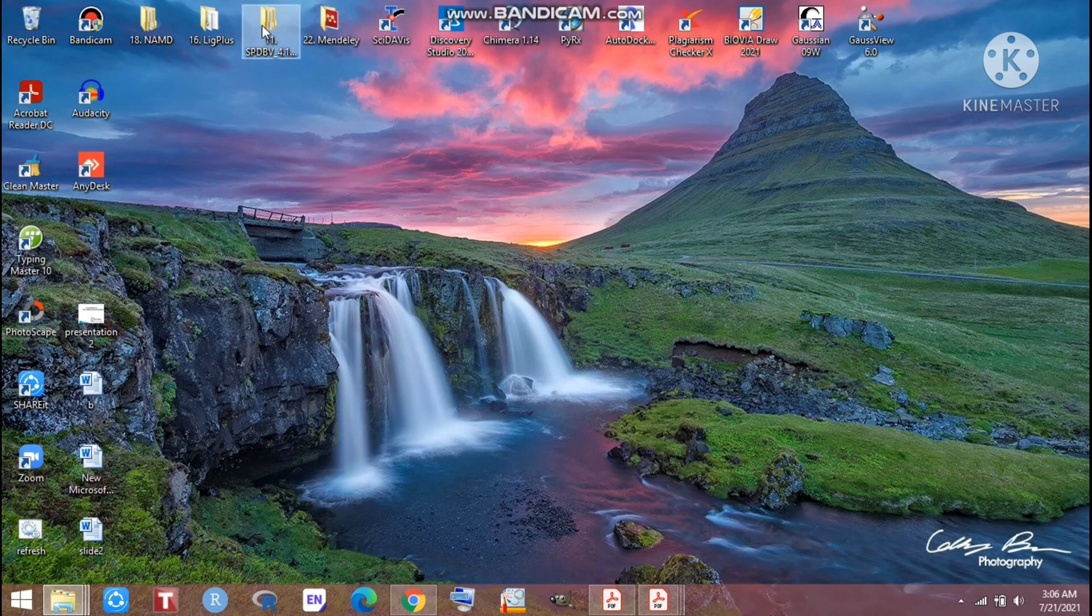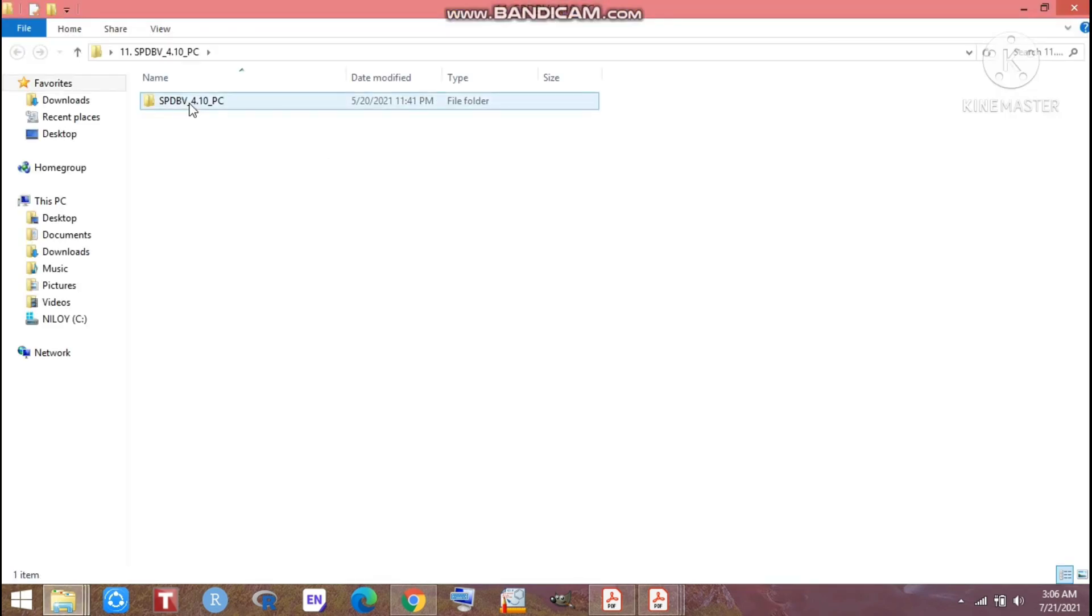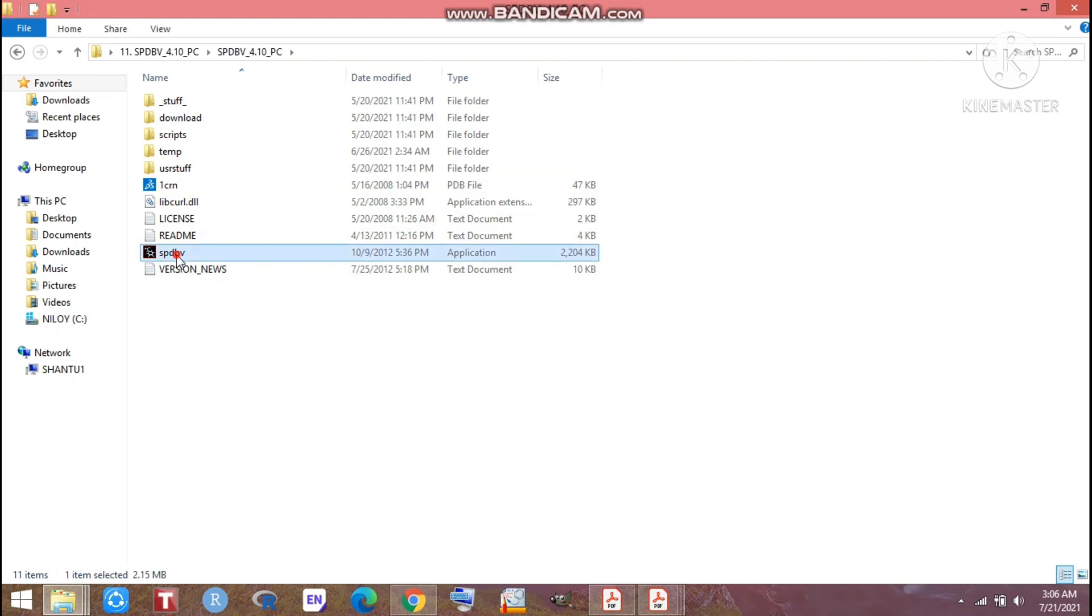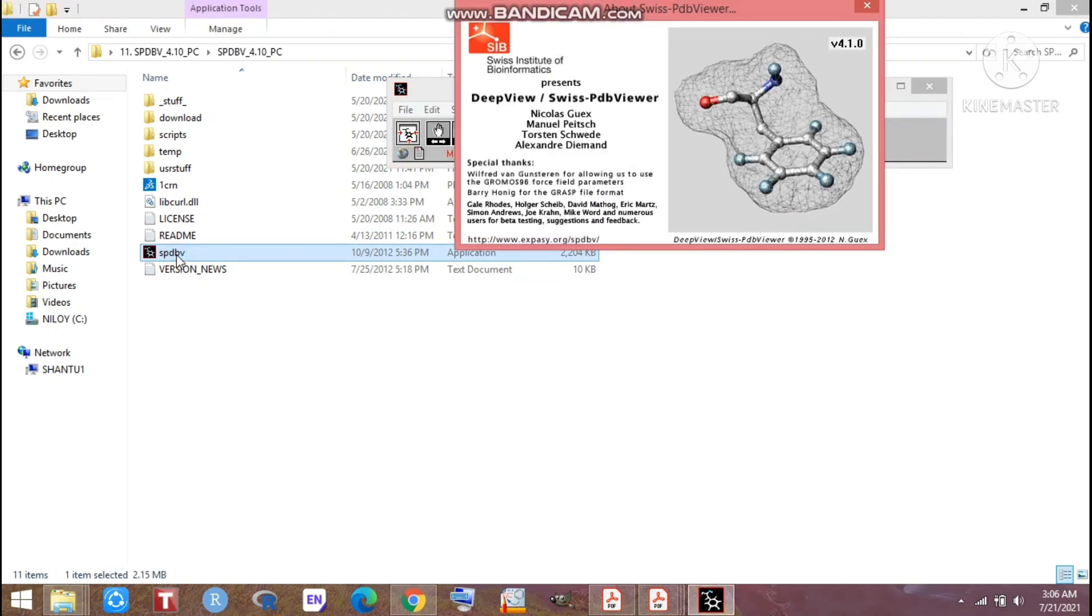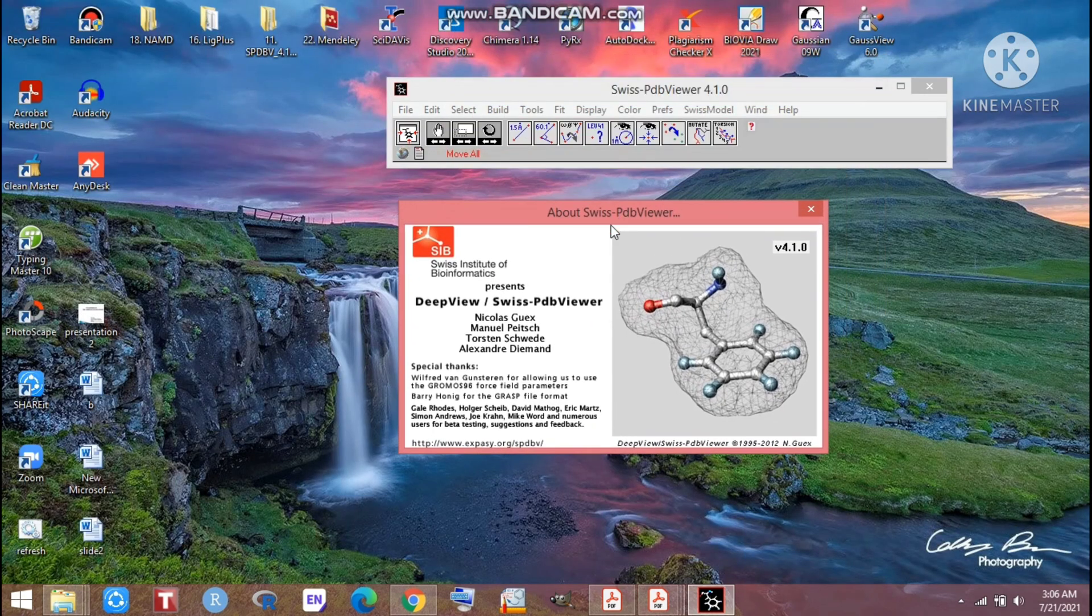When you download that, you will get this kind of folder. From this folder you have to go to the SPDV, that is an application of Swiss PDB viewer. After going there you will get this kind of window.